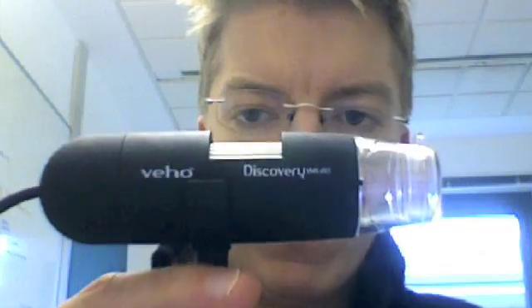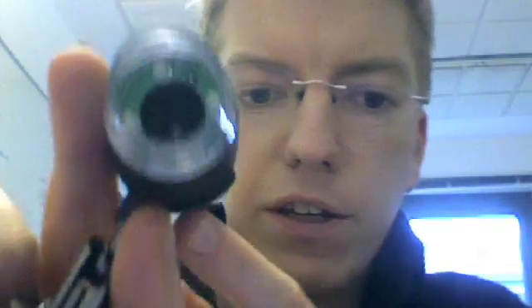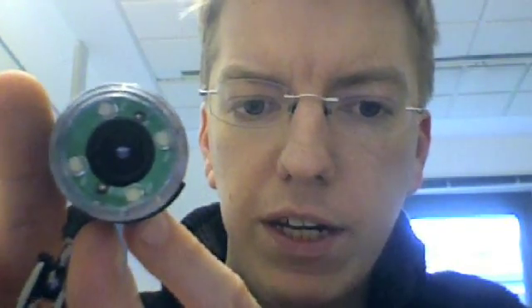So, here's the microscope. It's a couple of inches in size, and on the end there's actually a little plastic cap which protects the lens. Inside, you can just see there, there are actually four LEDs which you can light up using the software. It's a 1.3 megapixel camera.